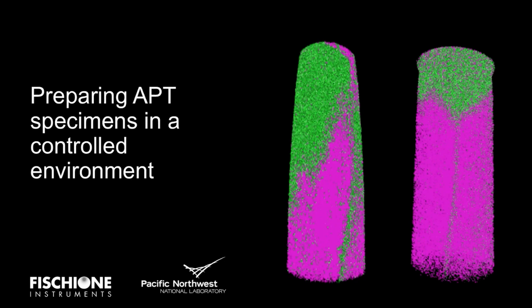In the case that we found here with the magnesium, as I just mentioned, we found an increase in the yield. The samples were less prone to fracture during the measurement, which led to more data collection. So being able to remove that damage from the FIB in the ion mill, removing all that gallium damage, seemed to help. So it led to the collection of more data and better quality data. So we did find that to be the case with magnesium.